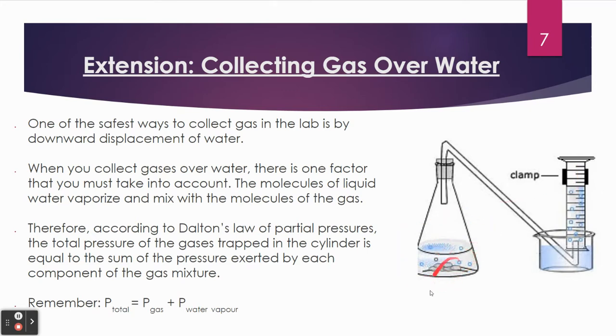So we put our zinc into our hydrochloric acid. First, fill up your graduated cylinder with water, make sure there are no air bubbles, and then you invert it so it's laying in a tub of water — the graduated cylinder stays completely full.